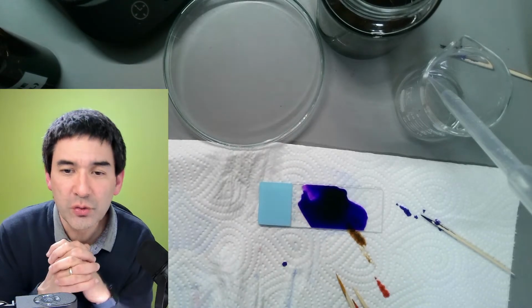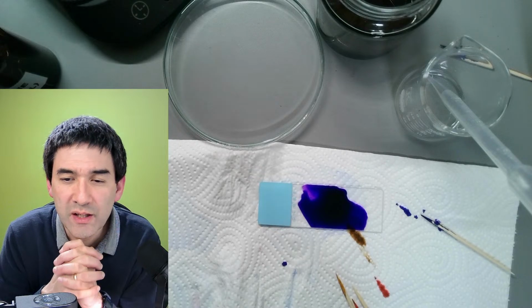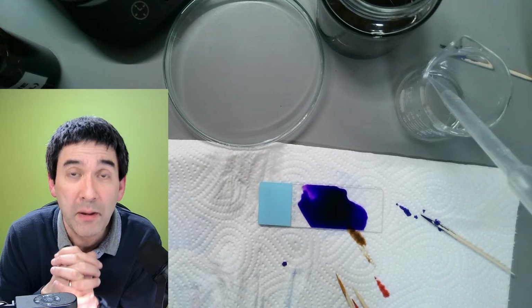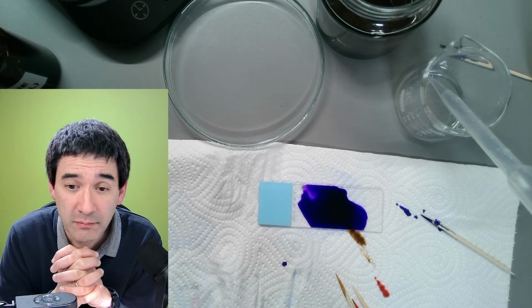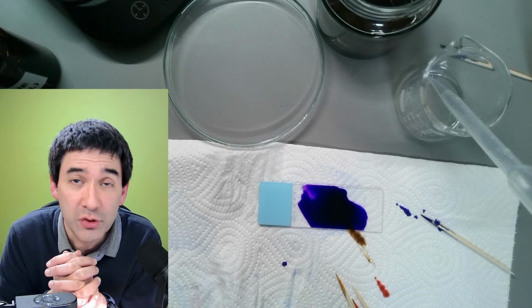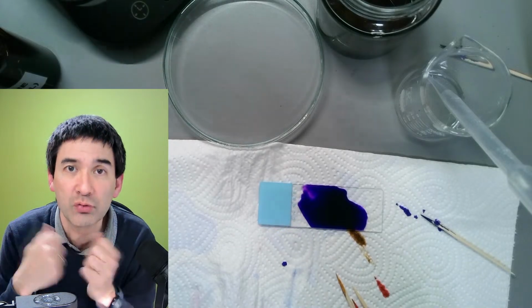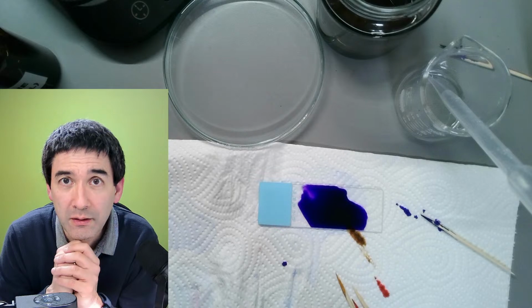Some comments. Is crystal violet useful for any other kind of specimens? I know safranin is used as a counter stain in several things. Honestly, crystal violet is extremely powerful, stains pretty much everything. I've also used Löffler's solution, which is methylene blue, but I find crystal violet gives you an even stronger stain. It's a question of trial and error, I would say.